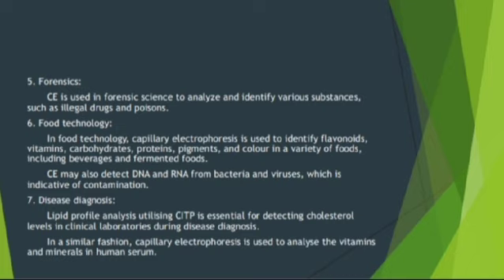In food technology, capillary electrophoresis is used to identify flavonoids, vitamins, carbohydrates, proteins, pigments, and color in a variety of foods, including beverages and fermented food. Capillary electrophoresis may also detect DNA and RNA from bacteria and viruses, which is indicative of contamination.